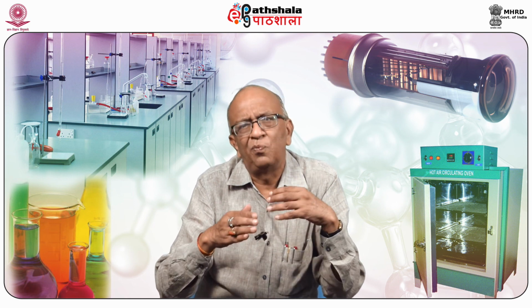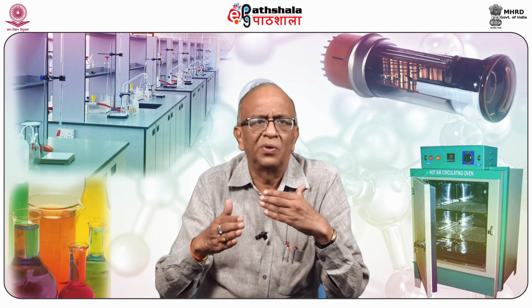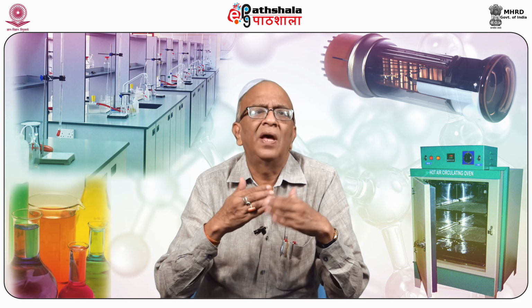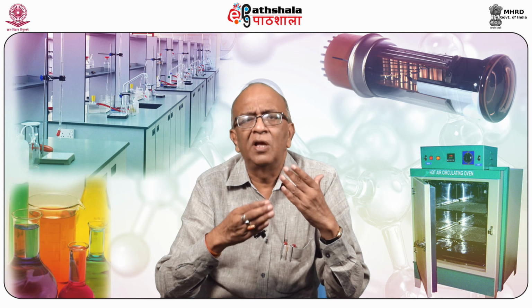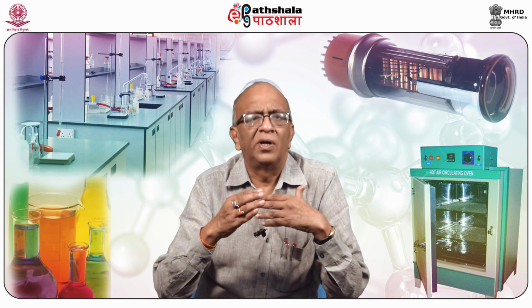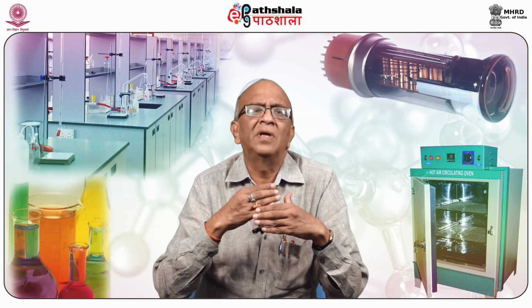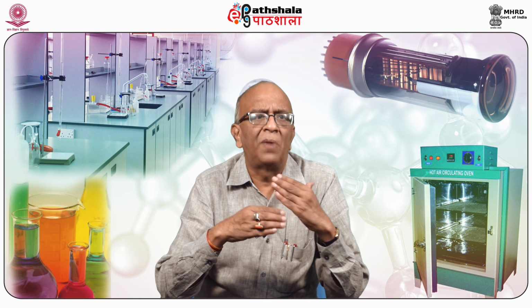Usually these days, paper chromatography has been replaced by thin layer chromatography because in thin layer chromatography, separations are sharper and it can also be used for quantitative purposes. And I am emphasizing again and again, the principle is the same. That principle involves partition.